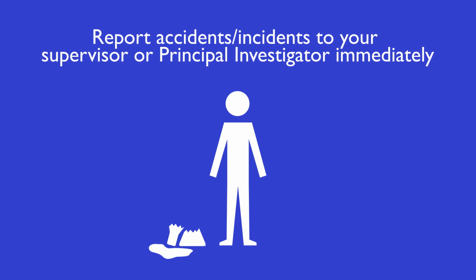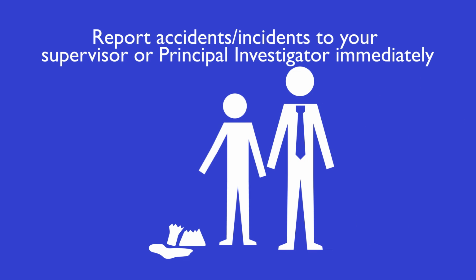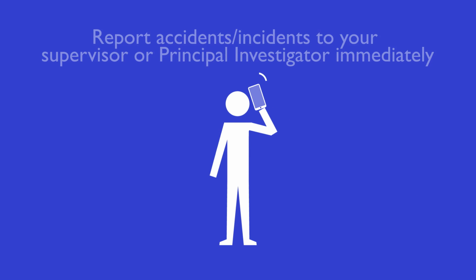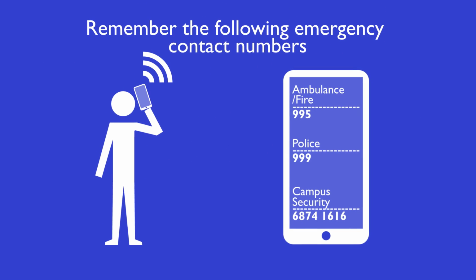Report any accident or incident to your principal investigator or supervisor immediately. You are also required to submit a report to the Office of Safety, Health and Environment via the online Accident Incident Reporting System within 24 hours. Remember the following emergency contact numbers.